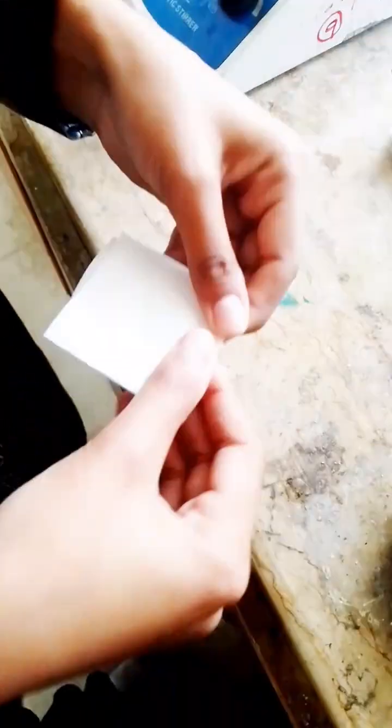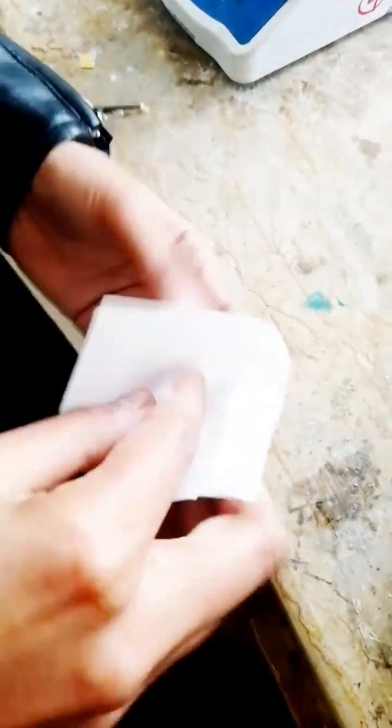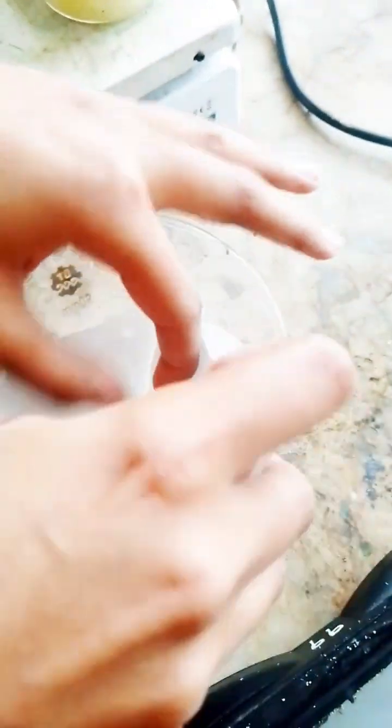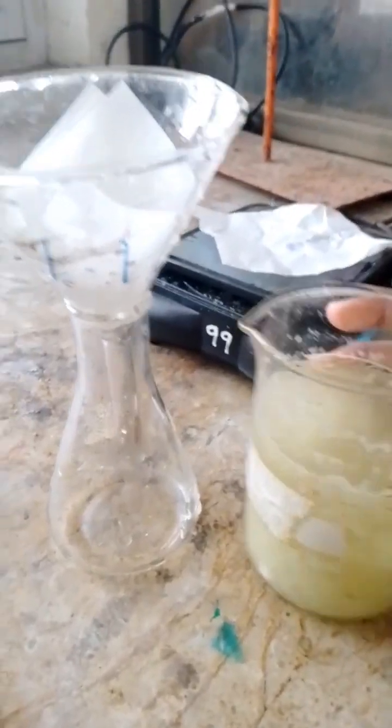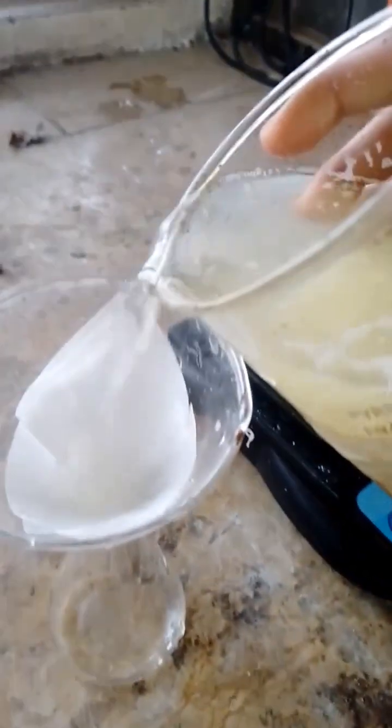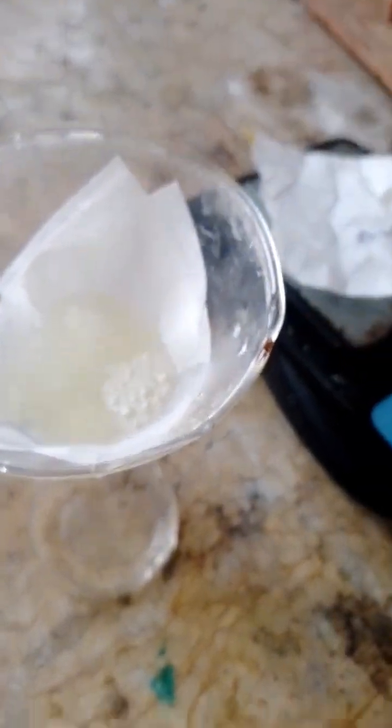After that, you will take a piece of filter paper, fold it like that, and then place the filter paper in a funnel accordingly. After that, you will add the extract gradually, step by step.